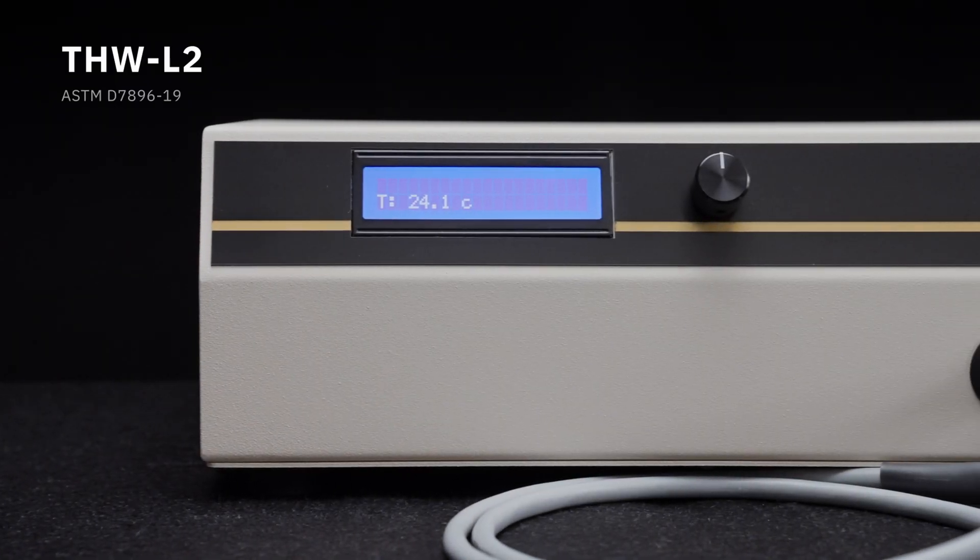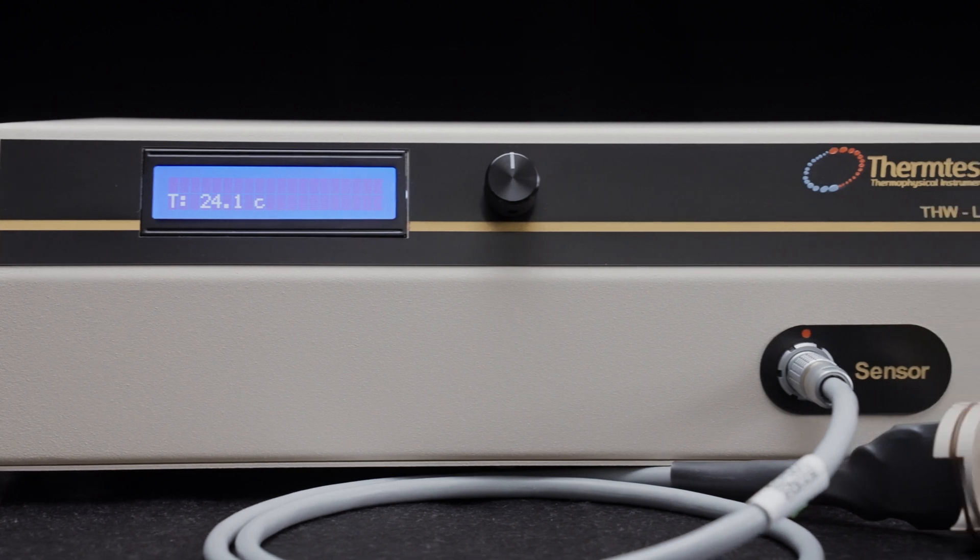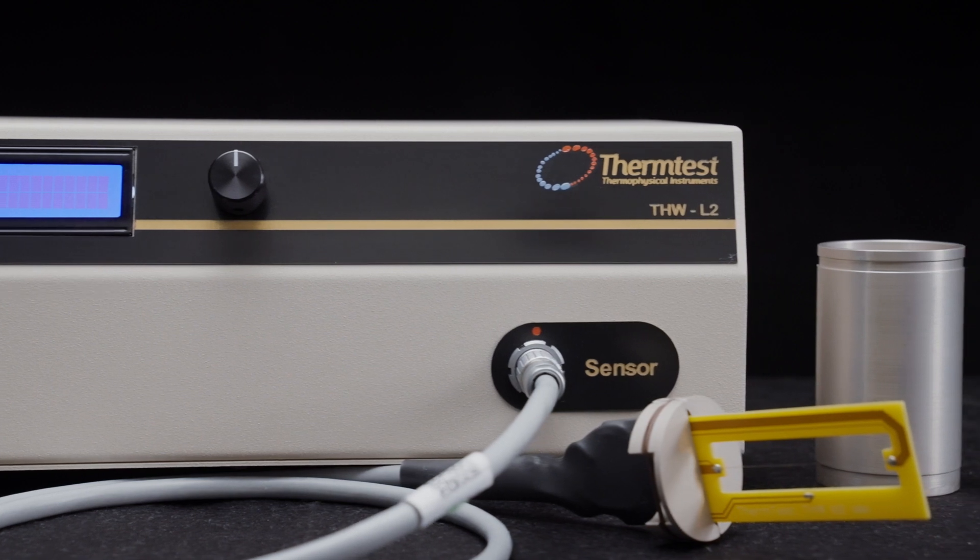Introducing the THW L2 for primary measurement of liquids and pastes. The transient hotwire L2 was designed with speed and operational simplicity in mind.